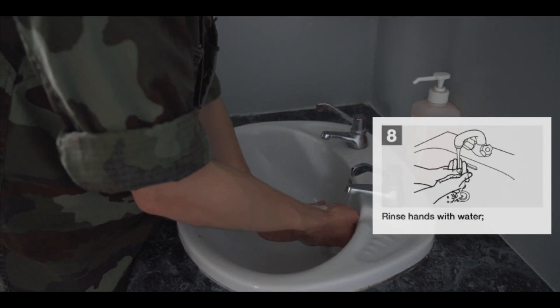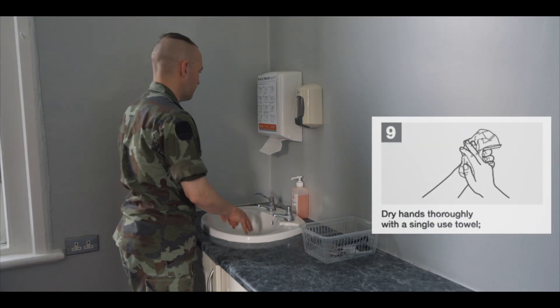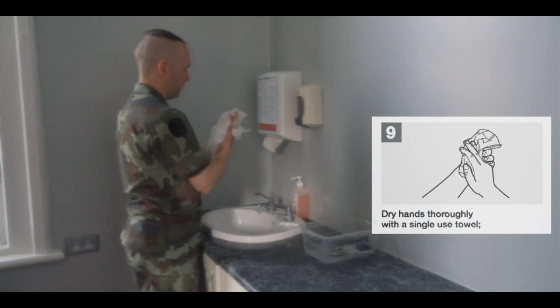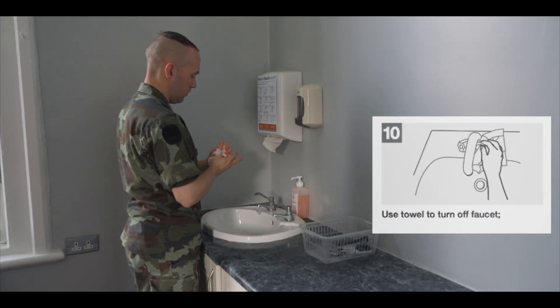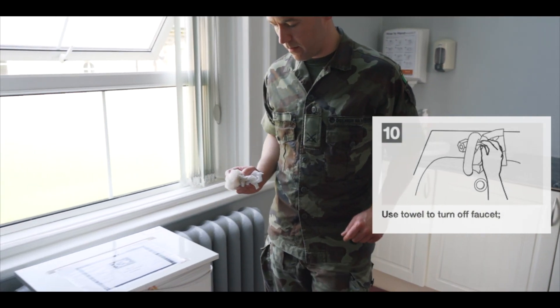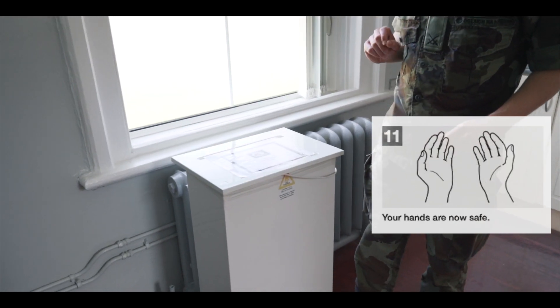Rotational rubbing backwards and forwards with clasped fingers of the right hand five times and vice versa. Rinse hands thoroughly with water. Dry hands completely with disposable paper towel. Use the paper towel to turn off the tap, ensuring your hands do not get contaminated. Discard the paper towel into the waste bin. Your hands are now safe.